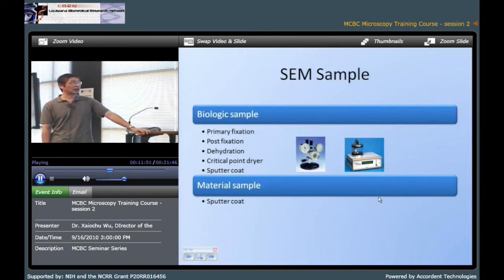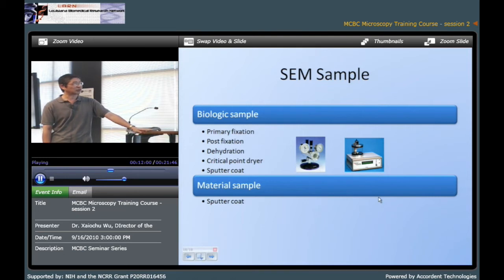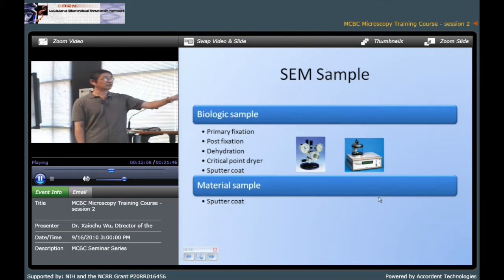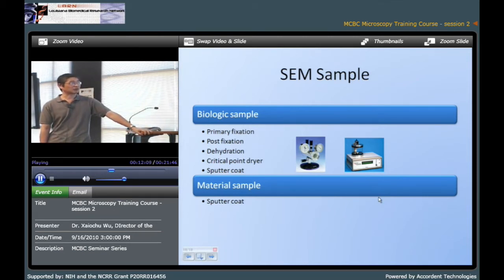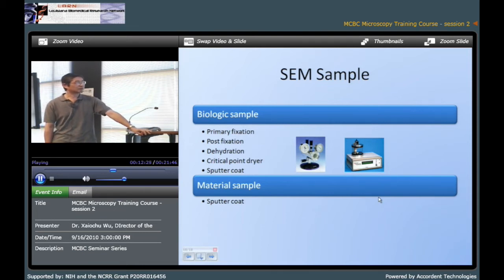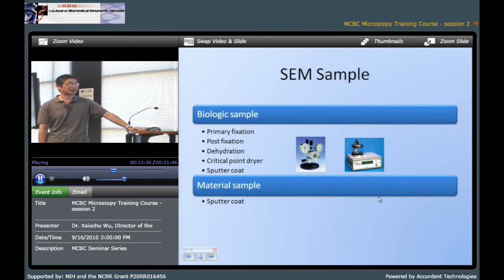SEM also needs a dried sample because it also works in high vacuum. For a biological sample, they need primary fixation, post fixation, dehydration, and critical point drying and sputter coating. The critical point drying equipment allows you to get a dried sample without damaging the structure. Sputter coating is used to make your sample conductive. For material samples, if it is conductive then it is okay; if not conductive, sputter coating is still necessary.